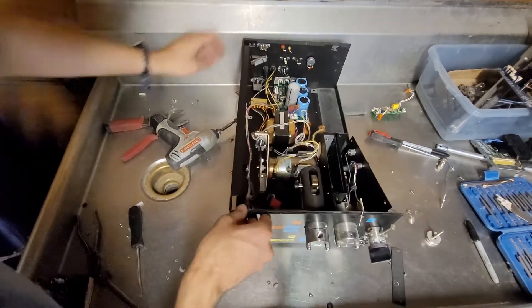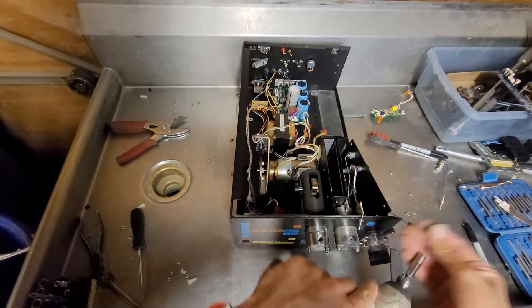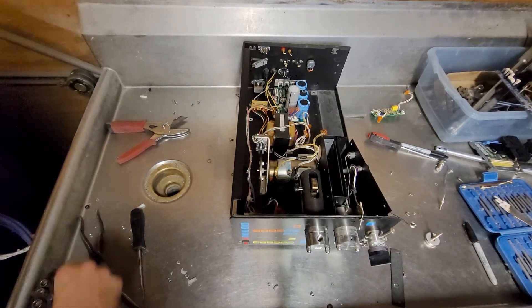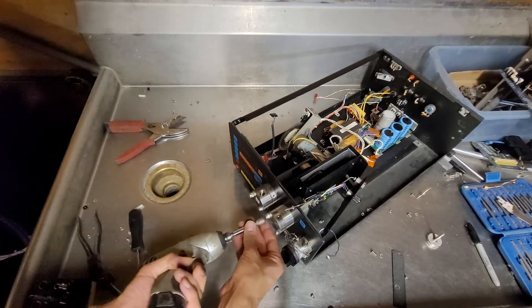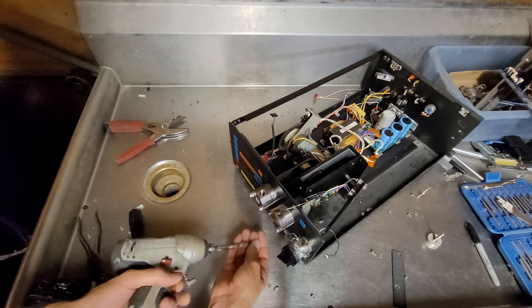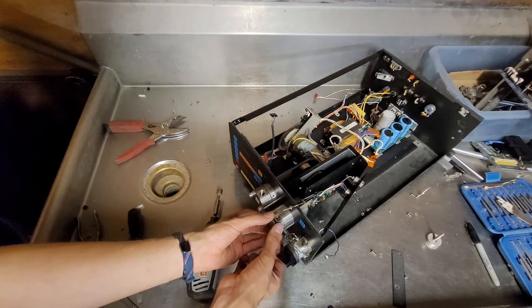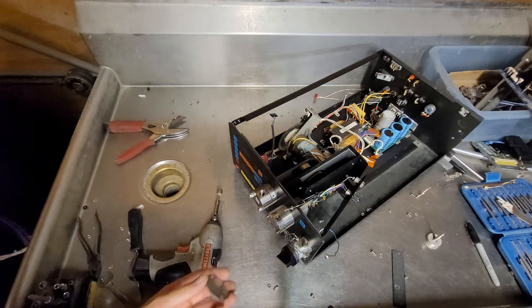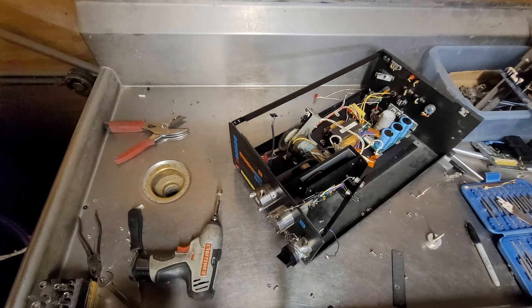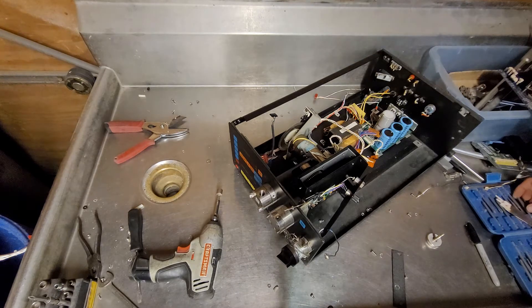I think I'm going to take this apart, but I need a bigger bit. I've got my safety glasses on. I see some really aggressive looking screws holding that together. Let's see if I have the right hex bit for that.